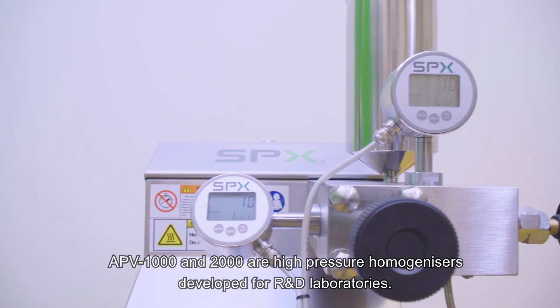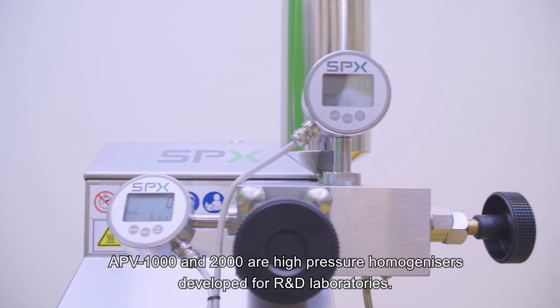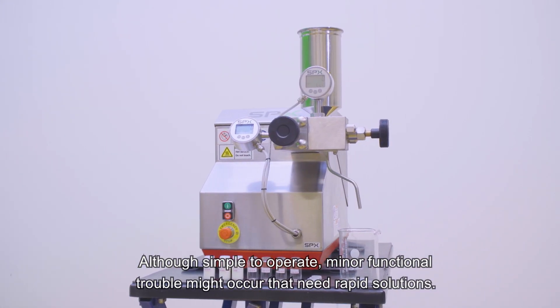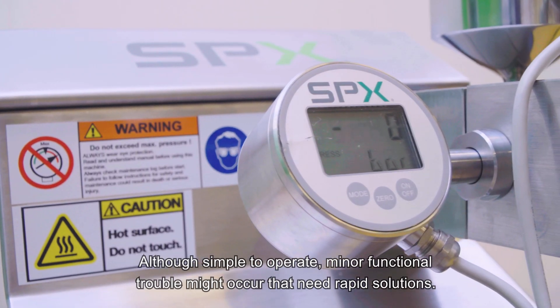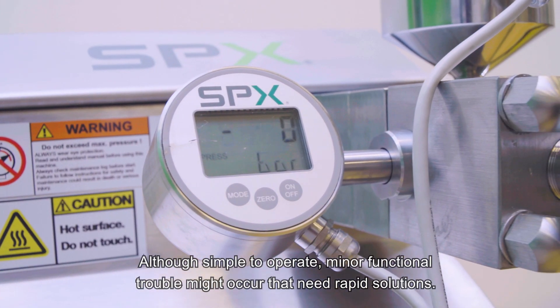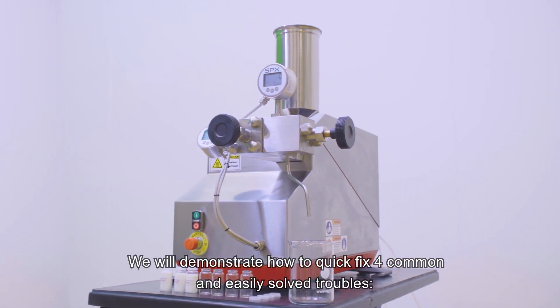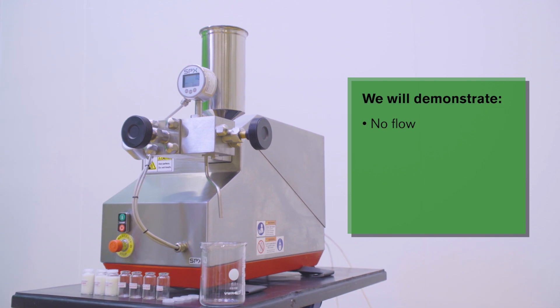APV1000 and 2000 are high-pressure homogenizers developed for R&D laboratories. Although simple to operate, minor functional trouble might occur that need rapid solutions. We will demonstrate how to quick fix four common and easily solved troubles: no flow, erratic flow, no pressure, and plunger leakage.